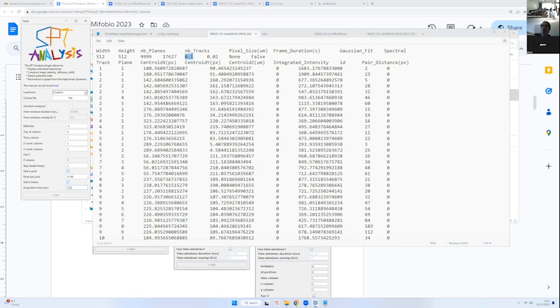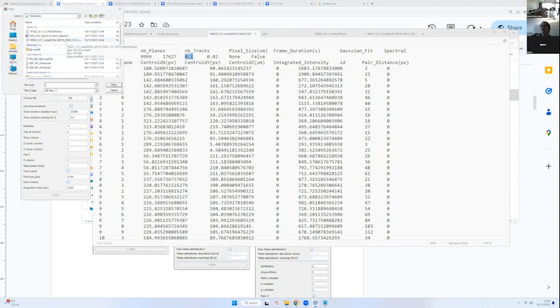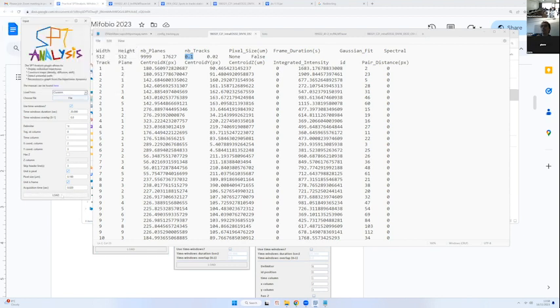Then one thing we need to determine right now is whether or not we want to use time windows. So if we want to cut our file into different windows, as David started to present with the wires, if you want to evaluate stability and things like that. We need to do that now, and we cannot change it afterwards. So let's just tick it, and let's just use the default, 20 seconds time windows, and 0 overlap between them. Then I choose my file, which is dataset 1, and I load.